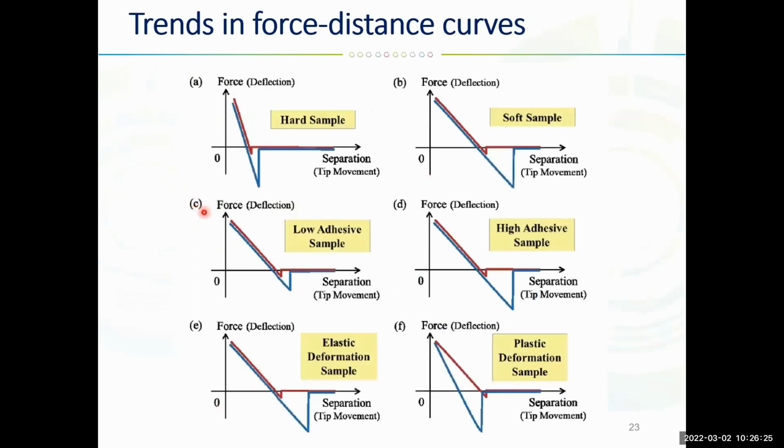And here I would just like to show you examples of different shapes depending on the sample and the force and deformation. Again, this shape strongly depends on the tip-sample interaction, right? So when we compare the contact region of these curves for hard and soft samples, it becomes clear that the slope of the curve increases with increasing hardness of the sample. Accordingly, the cantilever is strongly deflected from hard samples at the same height, because hard samples cannot be indented as easily as soft samples.